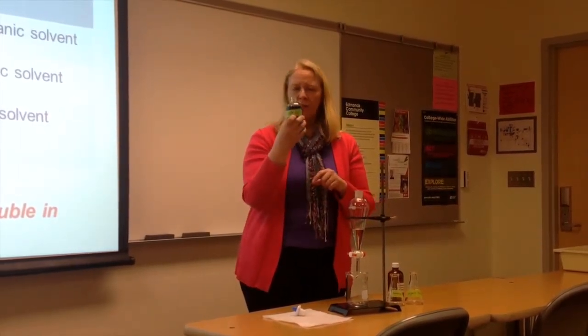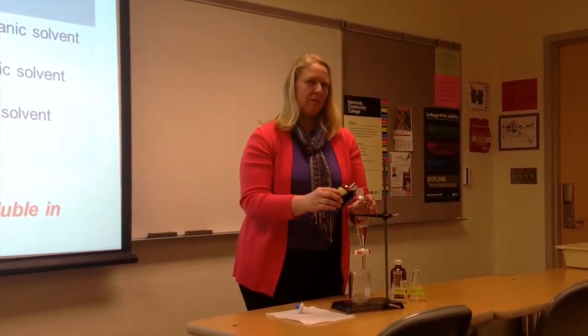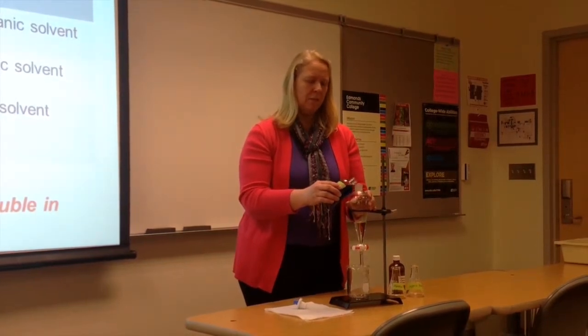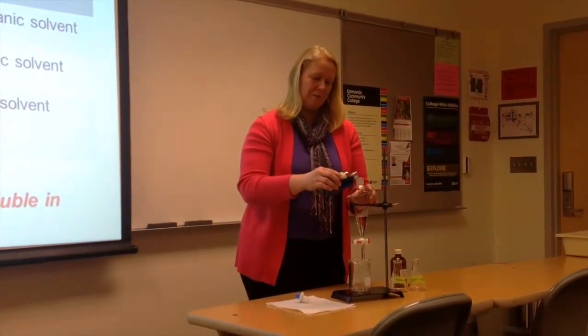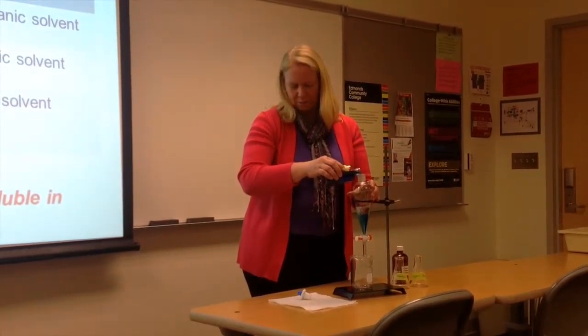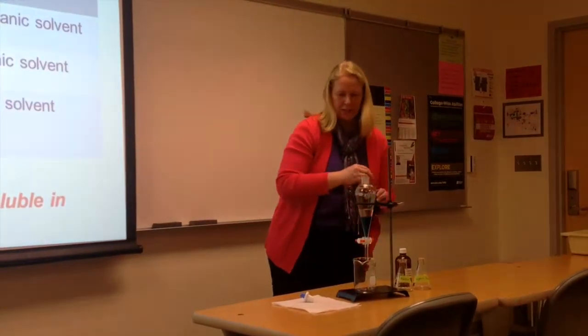So now I'm pouring my sodium hydroxide in there. And do you guys remember what we said from the densities? Is that going to be on top or going to be on the bottom? It should be on the bottom because the ether is less dense than the water. Exactly. Thank you. So that should go straight to the bottom. And it seems like it is.